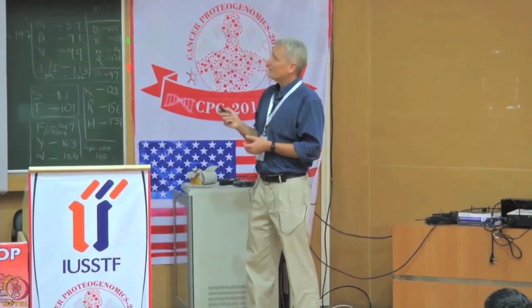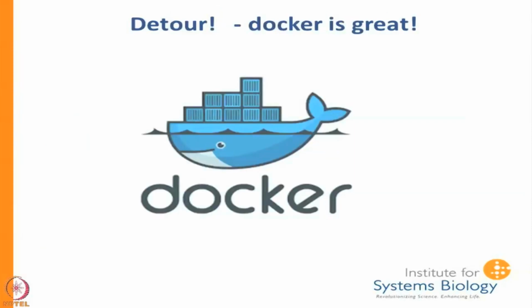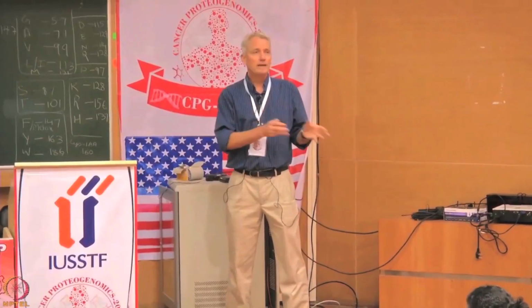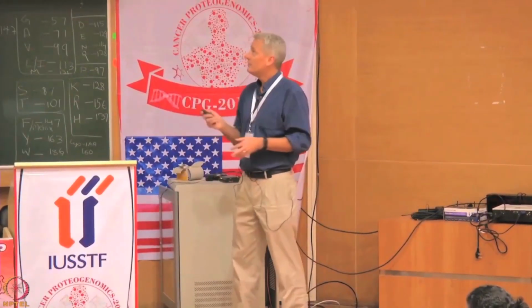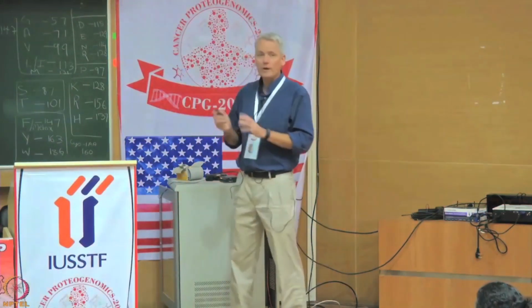So one thing I decided during Dr. Mani's talk, it seemed like a lot of people were a little confused. I think for this audience, it turns out that TPP, SpecTrast, MS Proteomics tools, as well as this data set, are available on Docker. For people that don't have a lot of software background, by all means, if there is a platform like Galaxy that has everything built in, use it. But if you want to download something onto your computer and run it, Docker is an excellent way to do it, because basically all of the maintenance is handled for you, and all you have to do is run it.